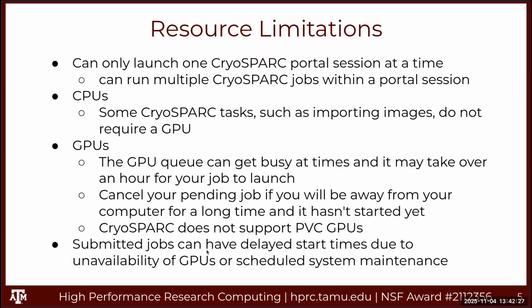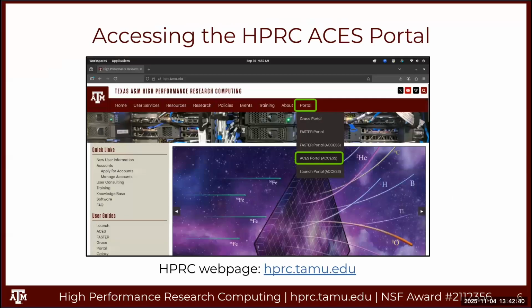PVCs are not supported. And submitted jobs can have a delayed start time because of the high demand of some of the GPUs, or may have a maintenance, and I'll show you how to see if we have a maintenance.